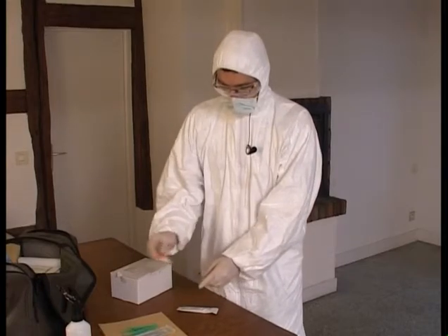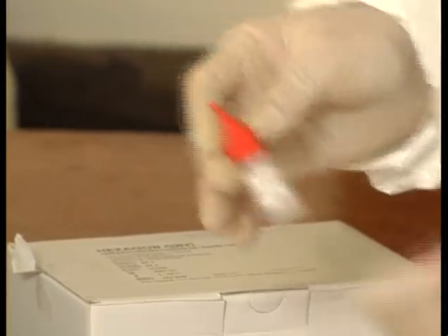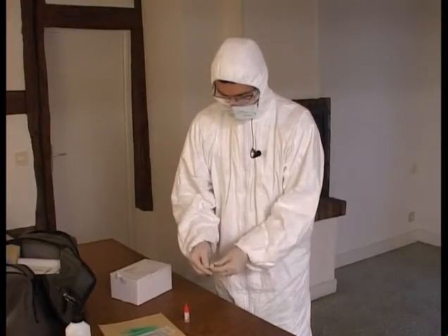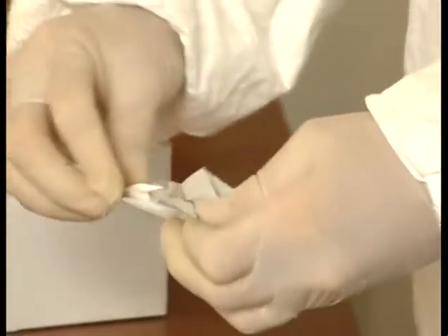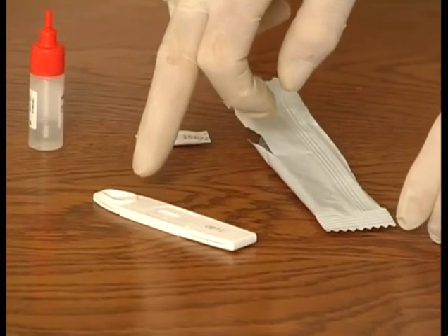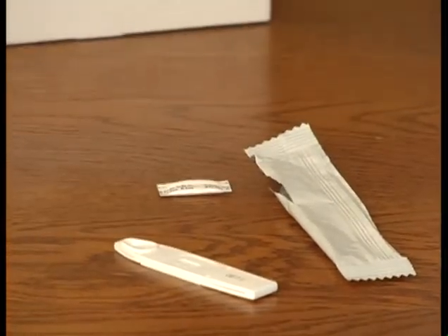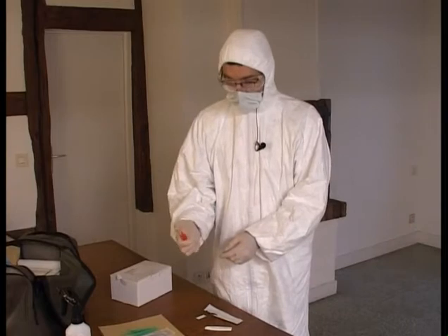Then I close the cap and shake the unit for a few seconds. Then I take the test medium from its packet. Here you have a zone marked with an S, which is the source in which we must put two drops of the solution obtained, which is located inside this tube. It's very simple.